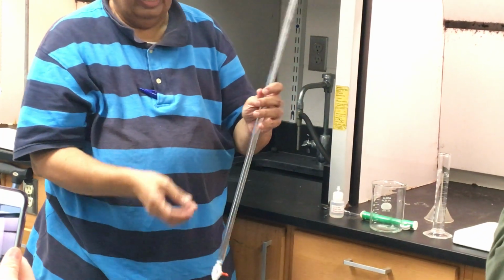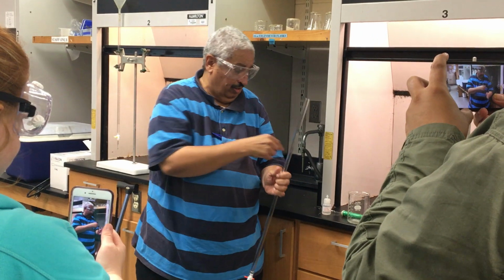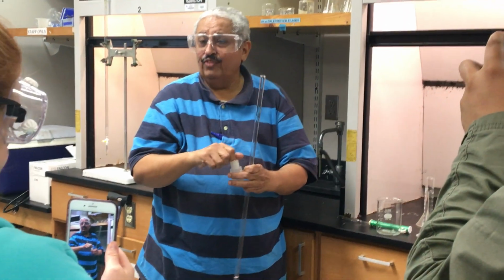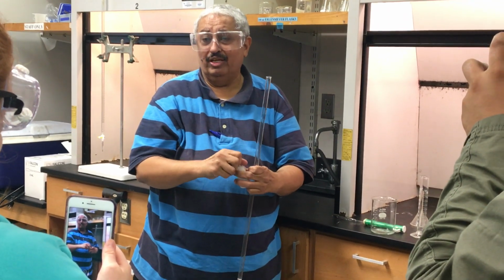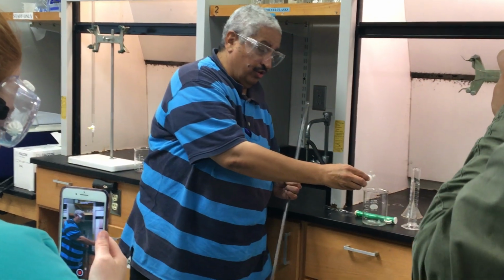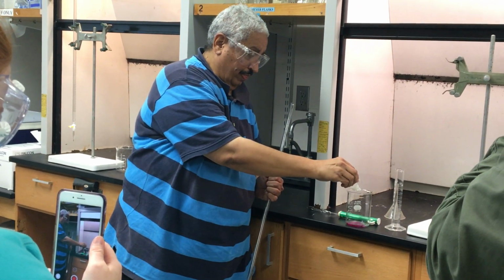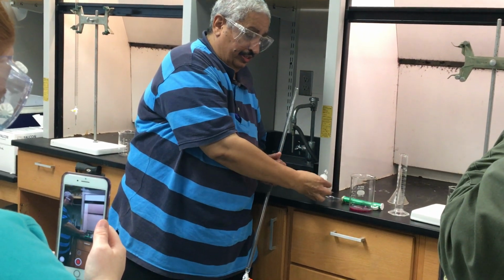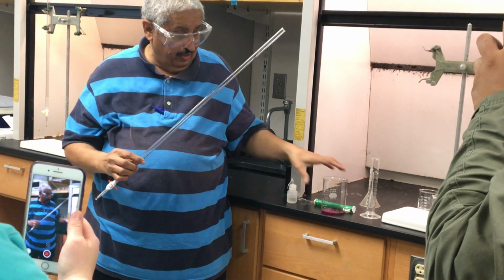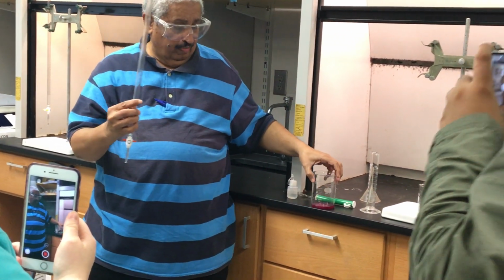Now I want to make sure that I did not mix the acid and base, that I did not clean it with an acid. So I put 3 drops of phenolphthalein. Phenolphthalein will turn pink in sodium hydroxide and colorless in acetic acid. So it has to show what now? Pink. Yes, I washed it with sodium hydroxide. That's the proof here.